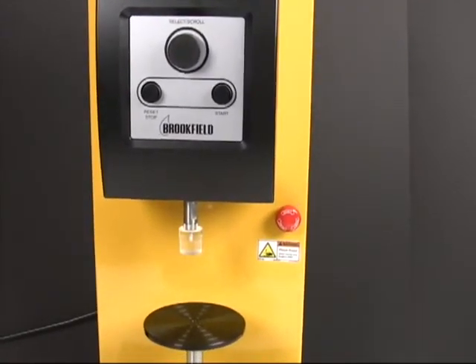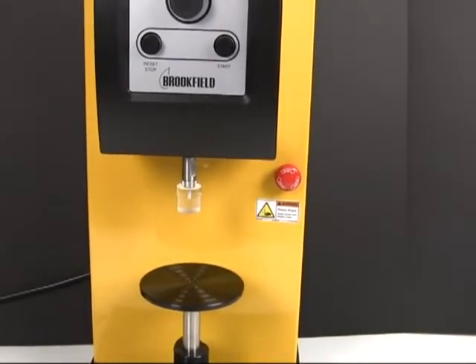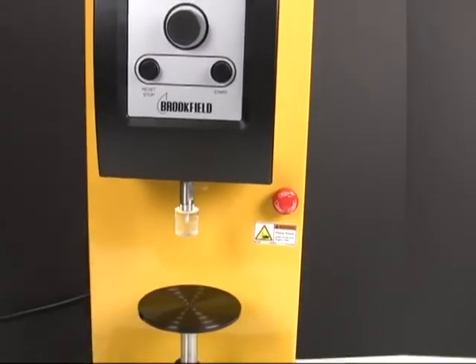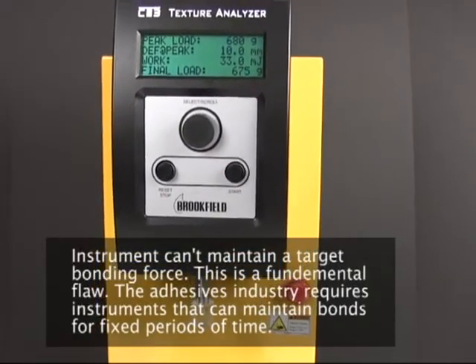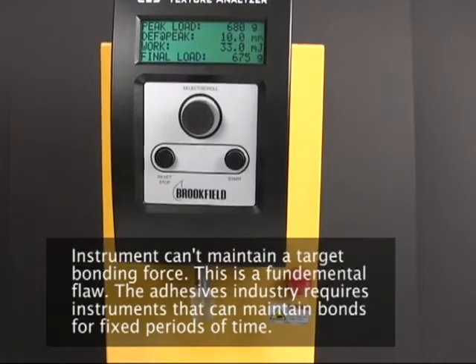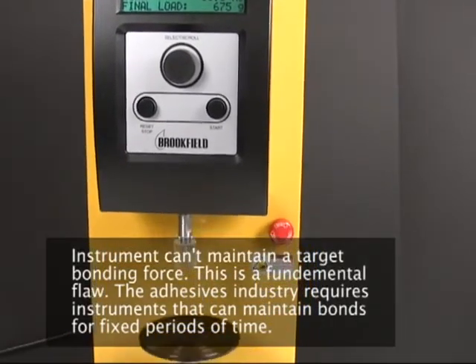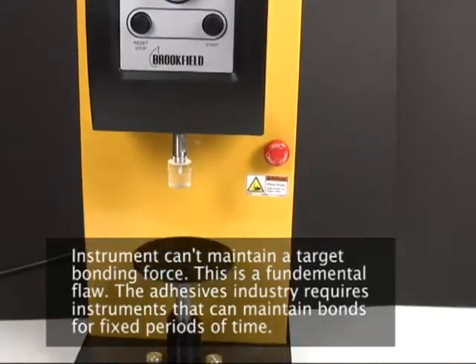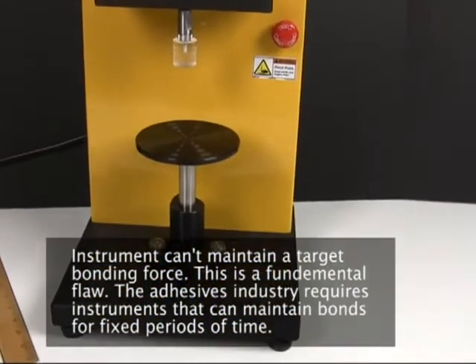In addition, we noticed that the instrument is also pretty bad — or rather, it can't do it at all — at maintaining a target force. This is mainly an issue for adhesives where you have to maintain or form a bond with the product, and it actually disqualifies the instrument for use in both adhesive and medical adhesive industries.